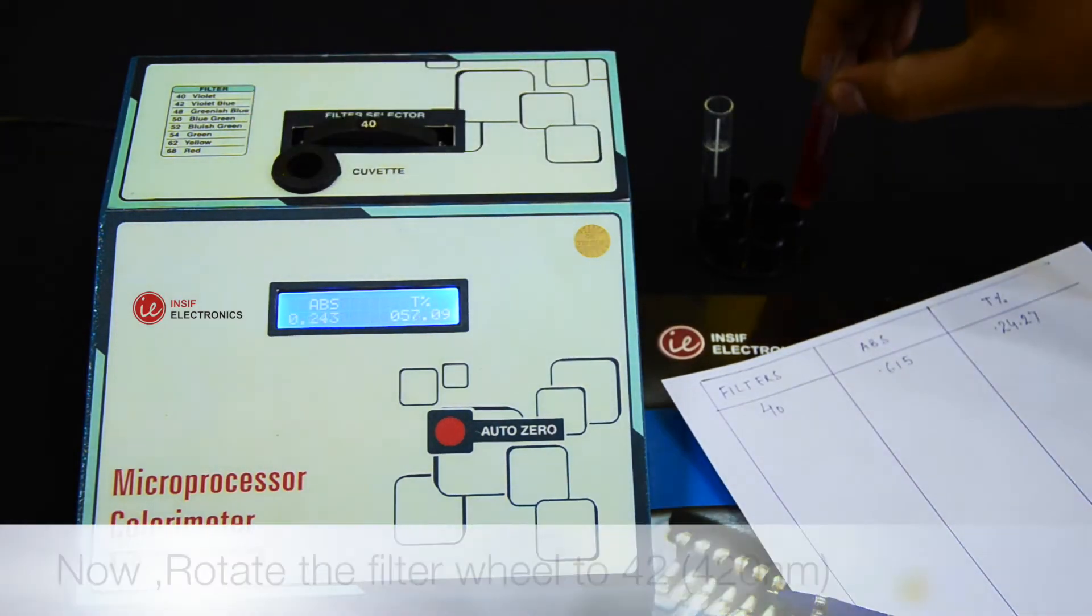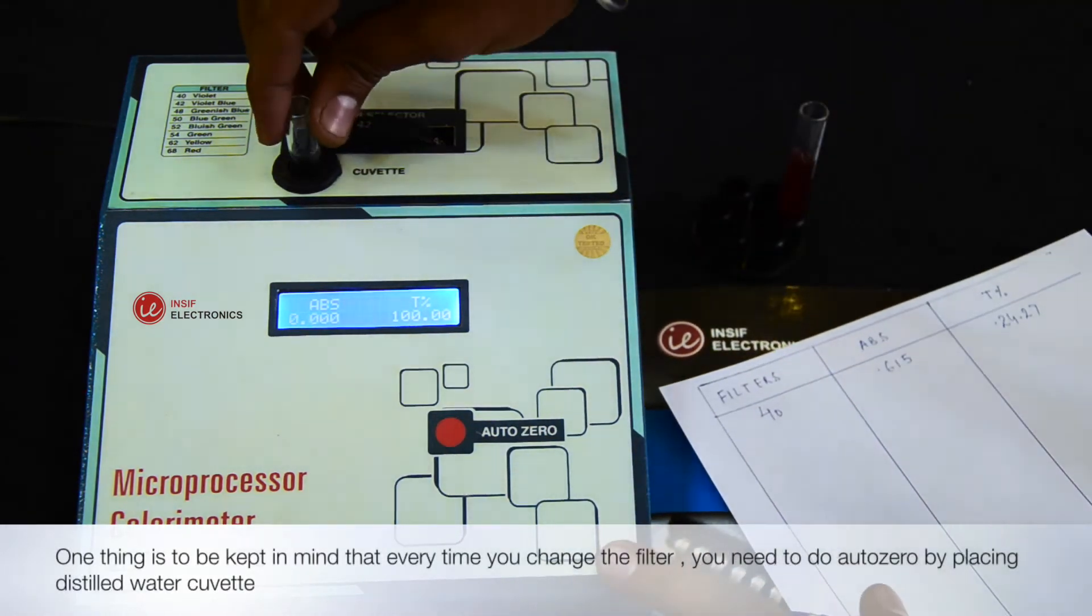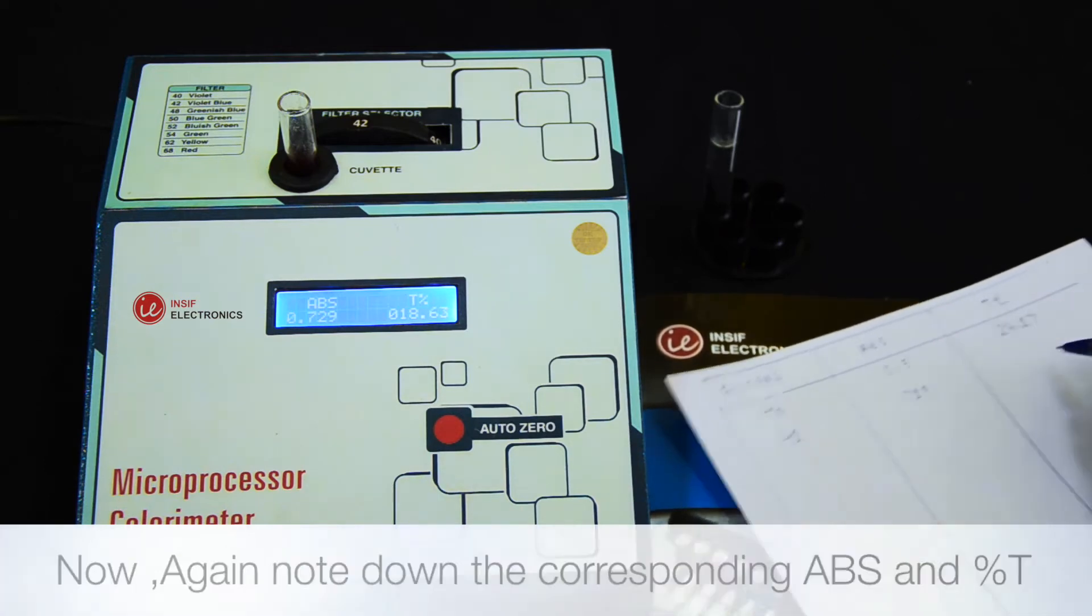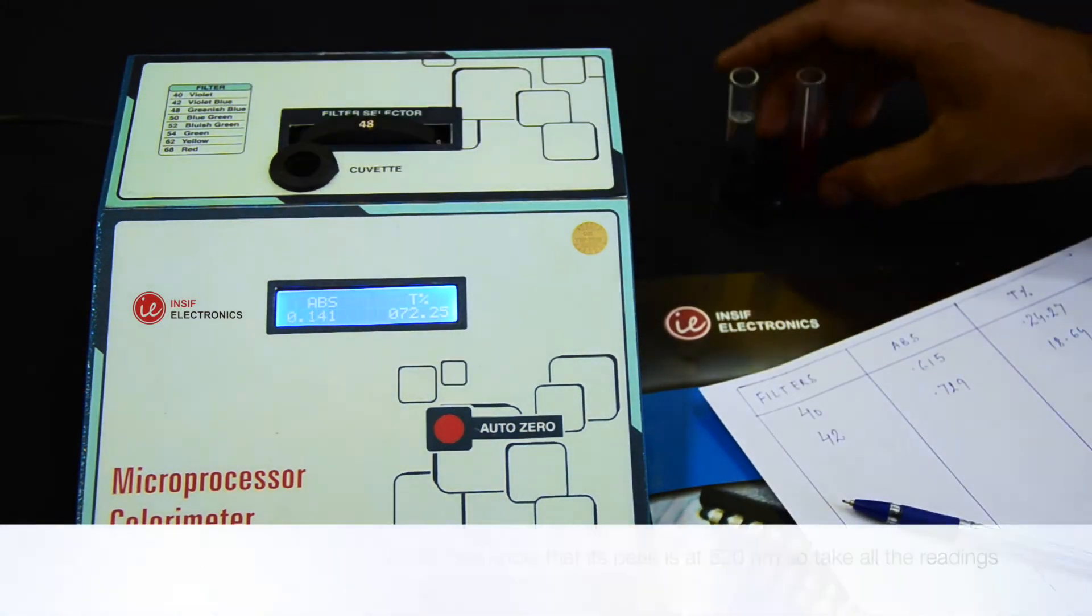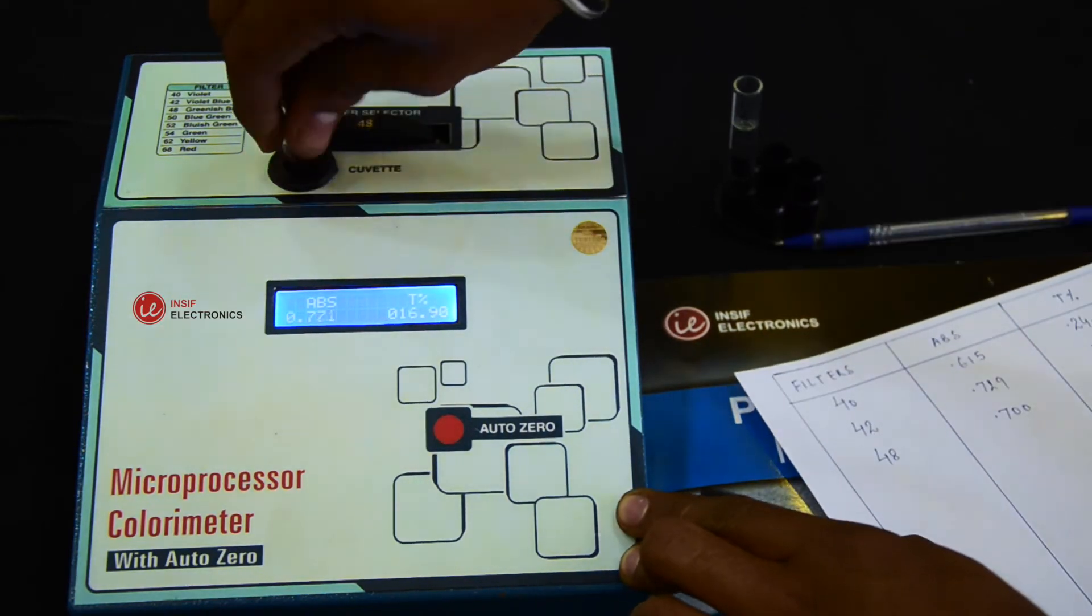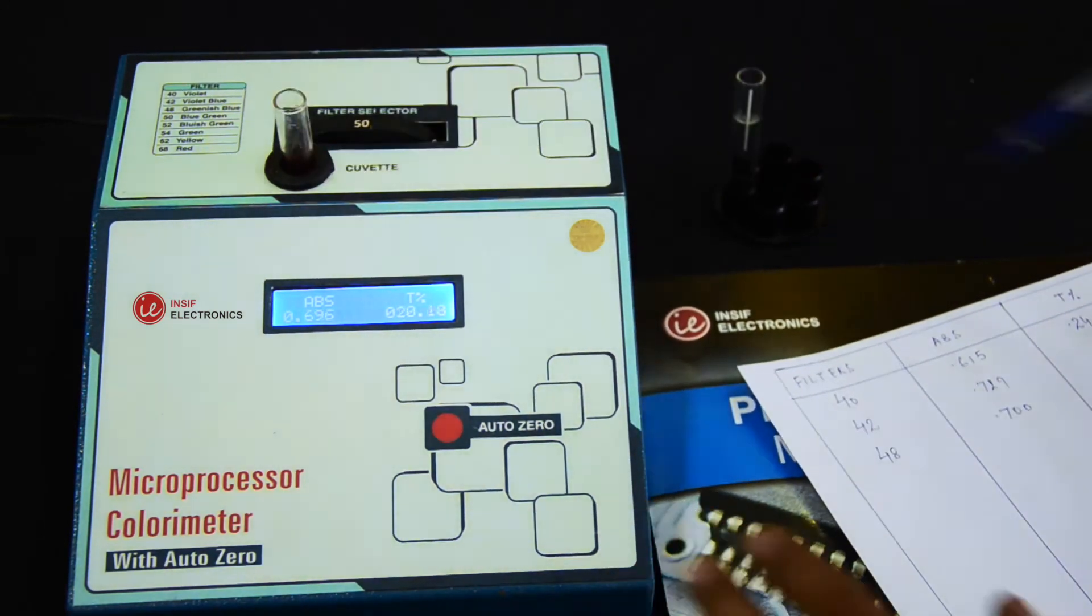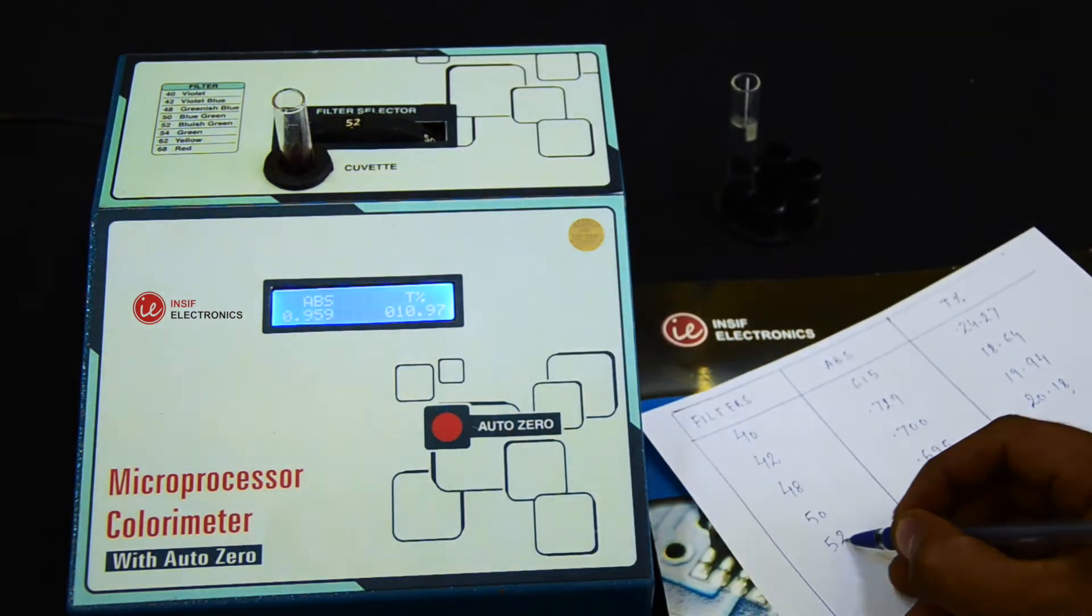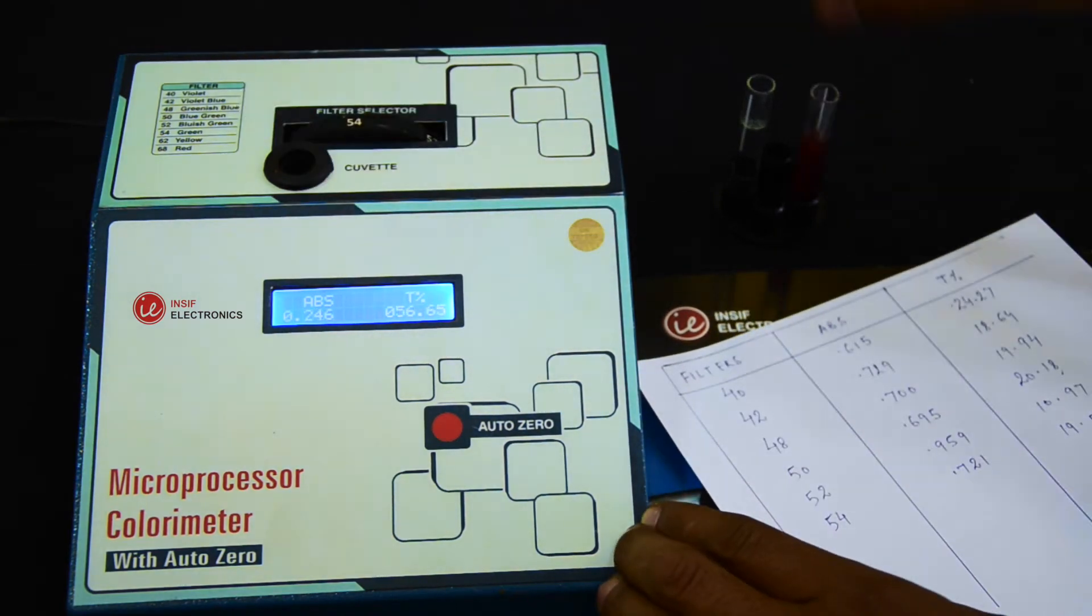Similarly, repeat the process for all other filters. One thing to be kept in mind is that every time you change the filter, you need to do AutoZero by placing the distilled water cuvette.